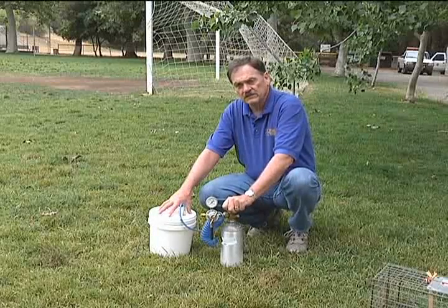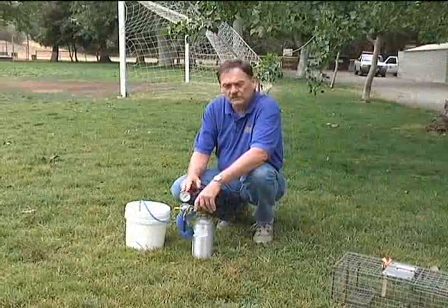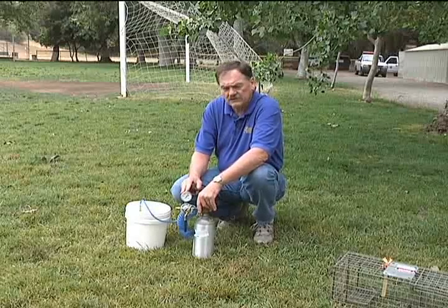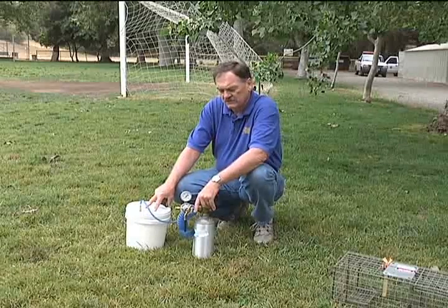Then turn it off and let the trap and animal stay in there for four or five minutes. CO2 gas will cause the animal to go unconscious and die. The American Veterinary Medical Association has determined that this is a humane method of euthanasia.